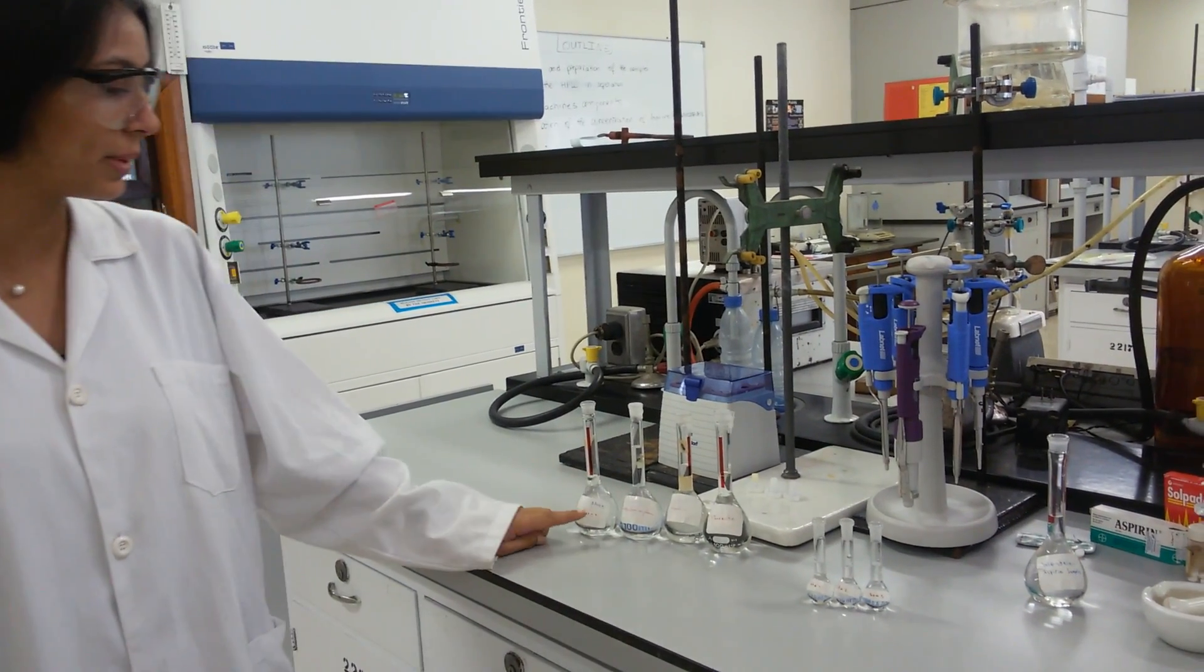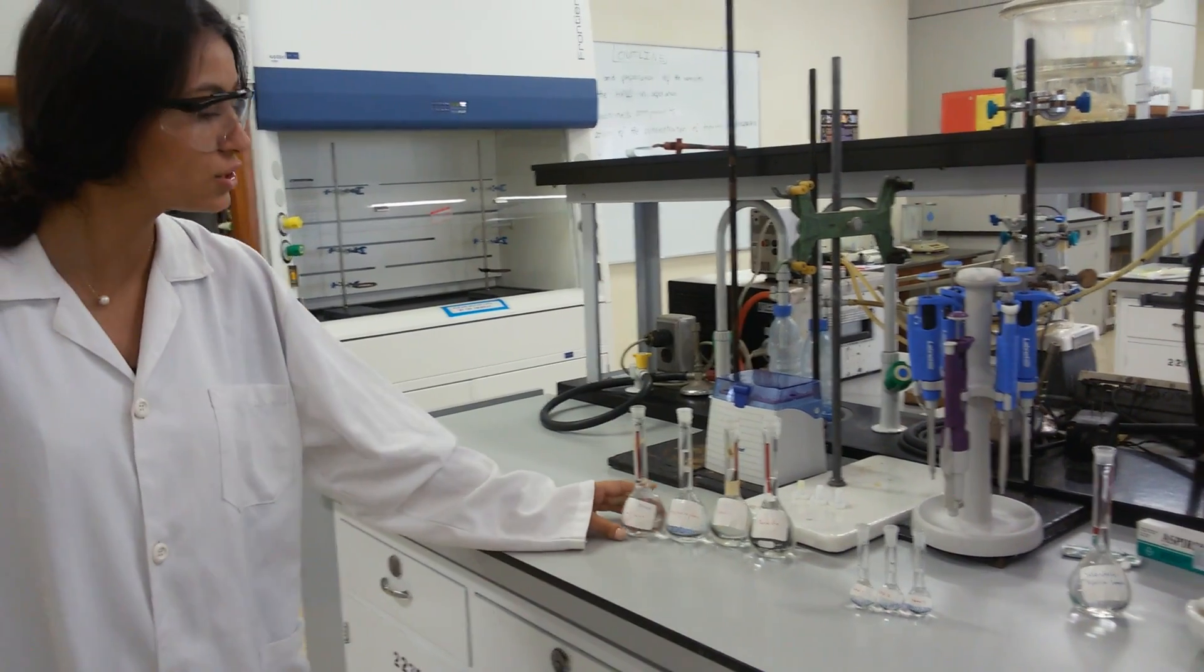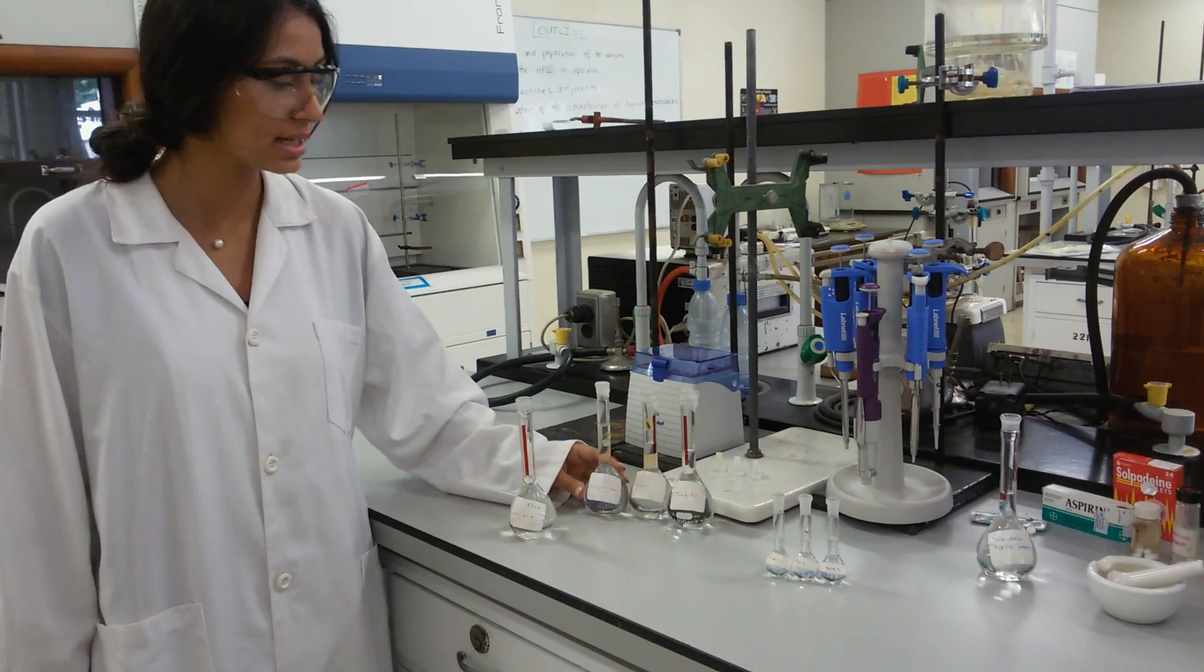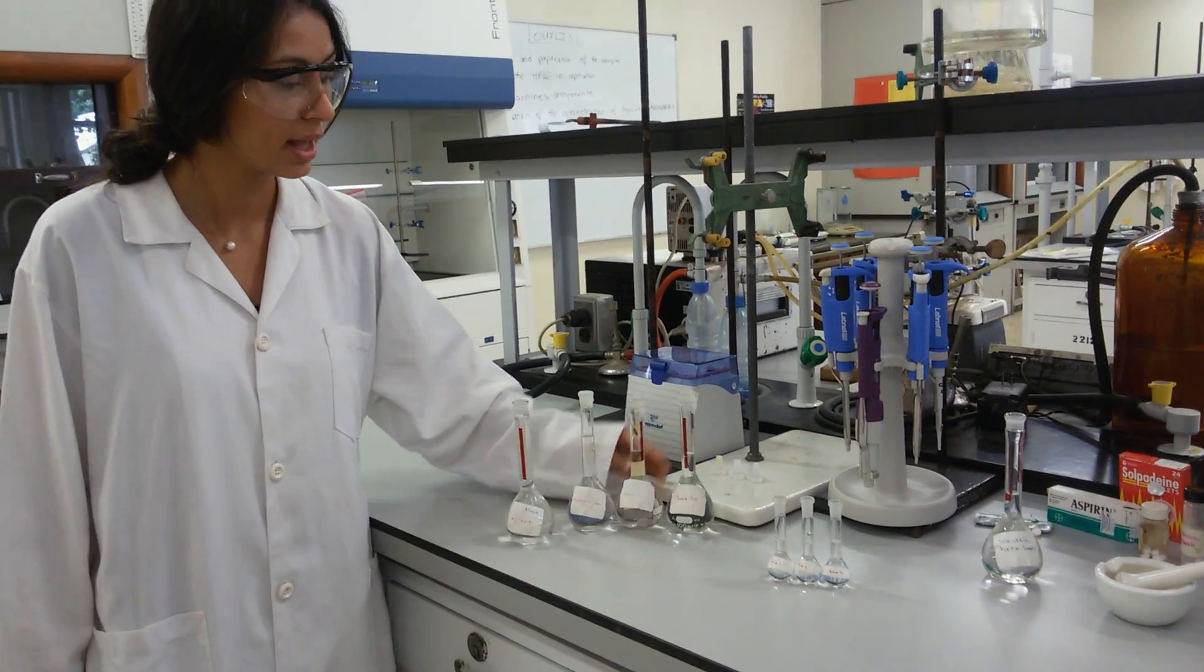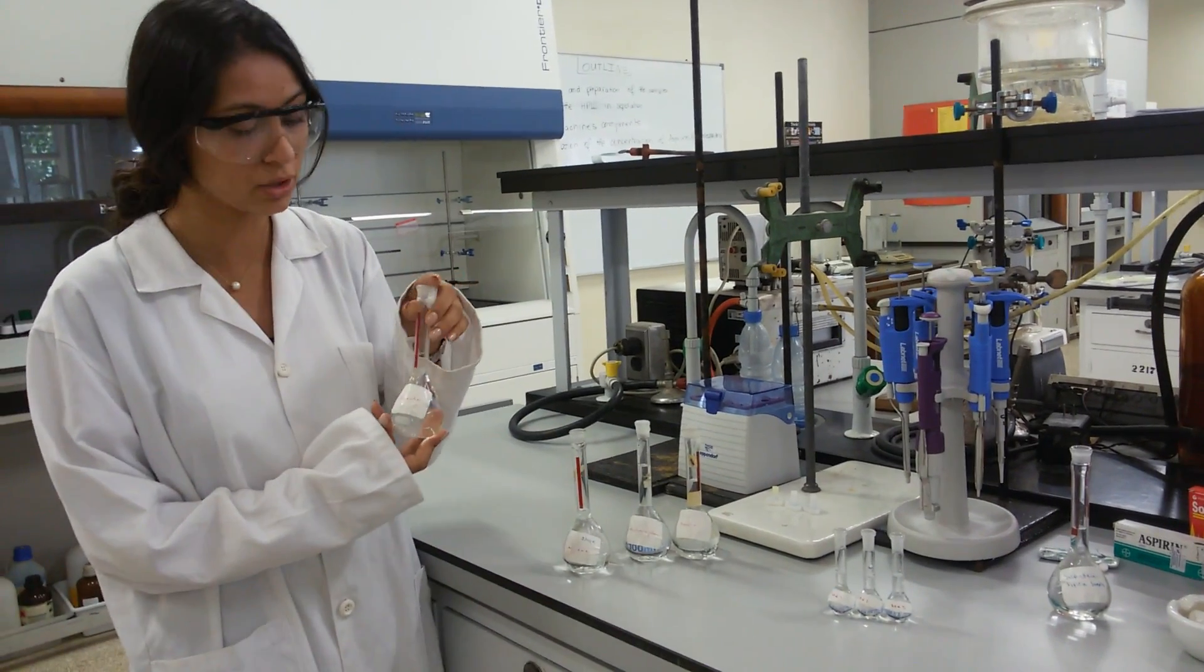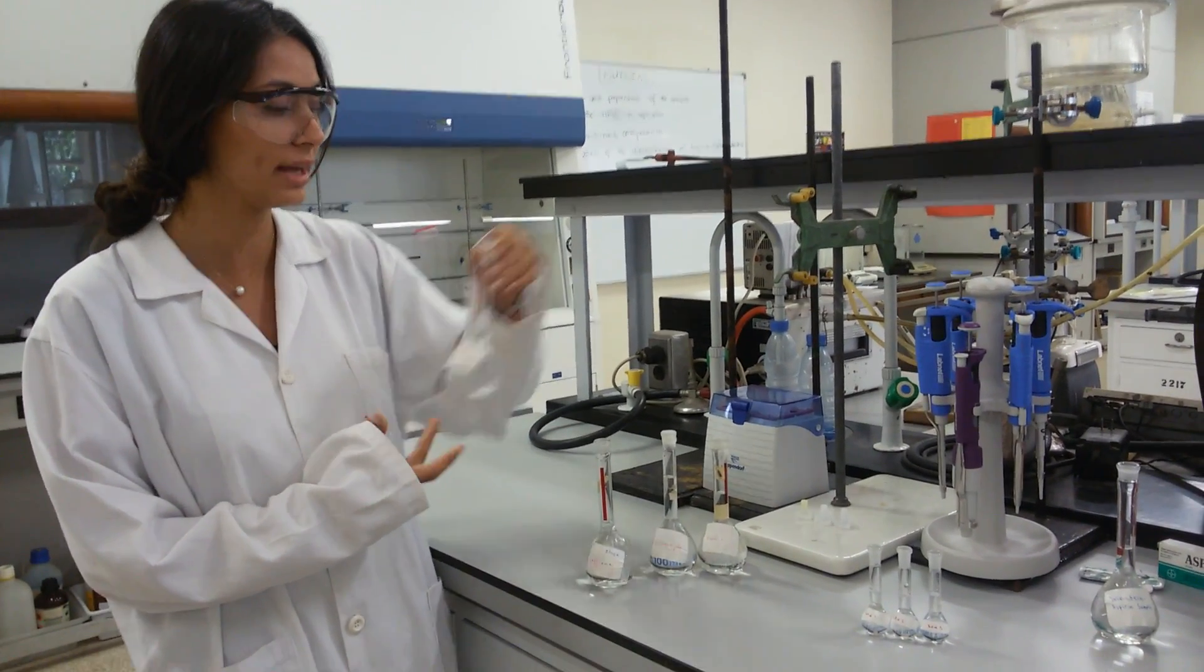First of all, we will start by preparing four stock solutions, each containing one of the four active ingredients: caffeine, acetaminophen, aspirin and phenacetine. During this experiment we will be using phenacetine as an internal standard in order to correct the errors.